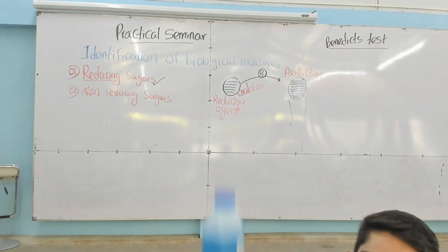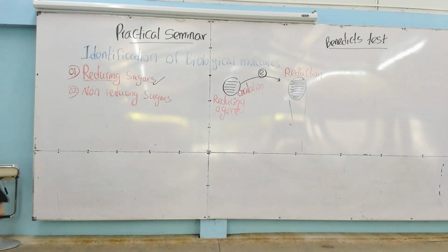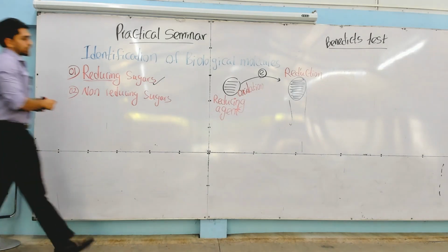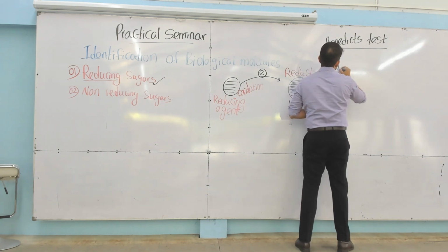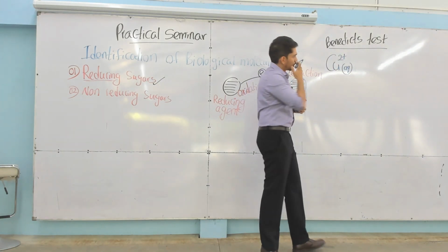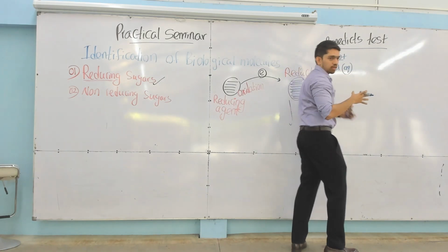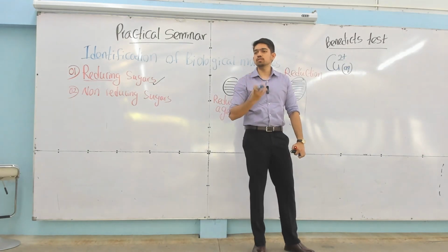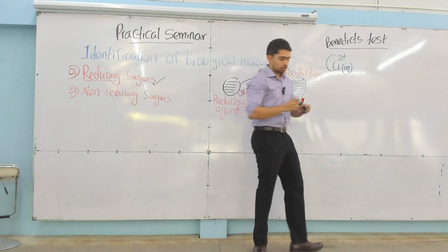Right? What color is it? Blue. So, using basic chemistry, what sort of species have a blue color? What is the metal ion that has a blue color in aqueous solution? Copper 2 plus, right? Cu2+ aqueous has a blue color. Okay? You know that your Benedict's reagent is aqueous copper 2 plus in an alkaline medium. Alkaline means a slightly basic aqueous copper 2 plus solution. Simply that.